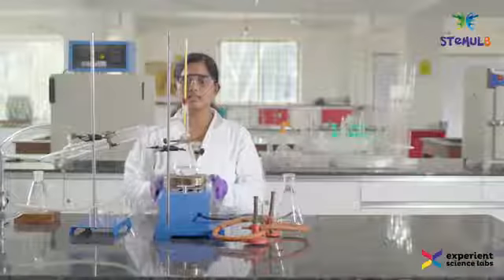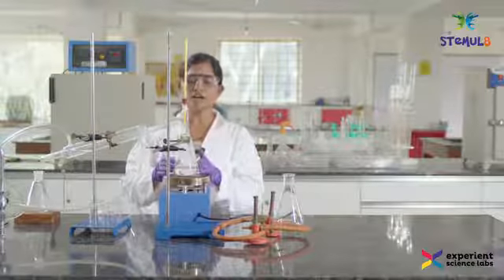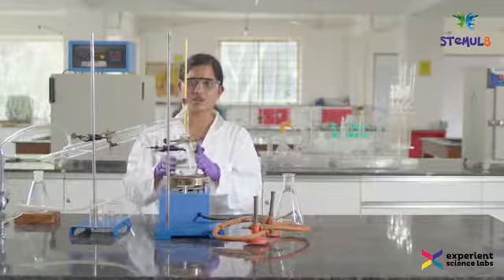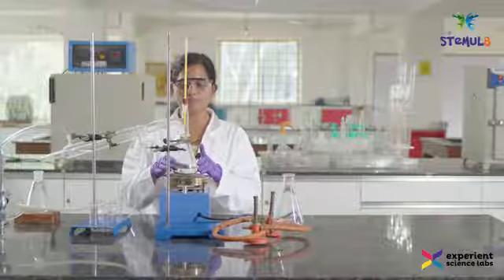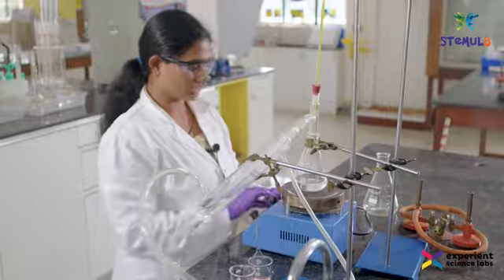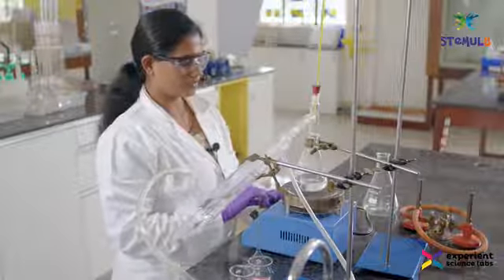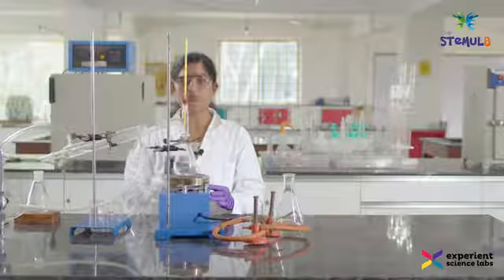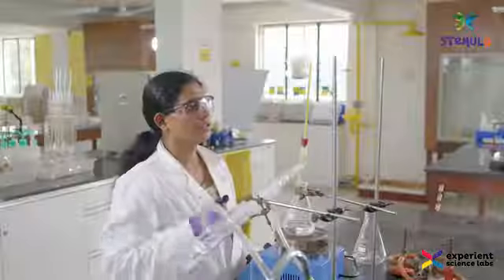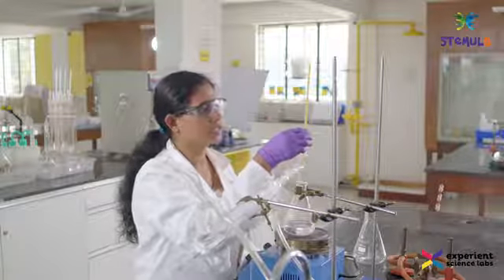This is a heater, and before we switch on the heater, make sure that you also put anti-bumping granules into this conical flask. I have used pebbles in the conical flask, and now I am going to start heating it. So I need to wait for some time. Now the temperature in the thermometer is 28 degrees Celsius.